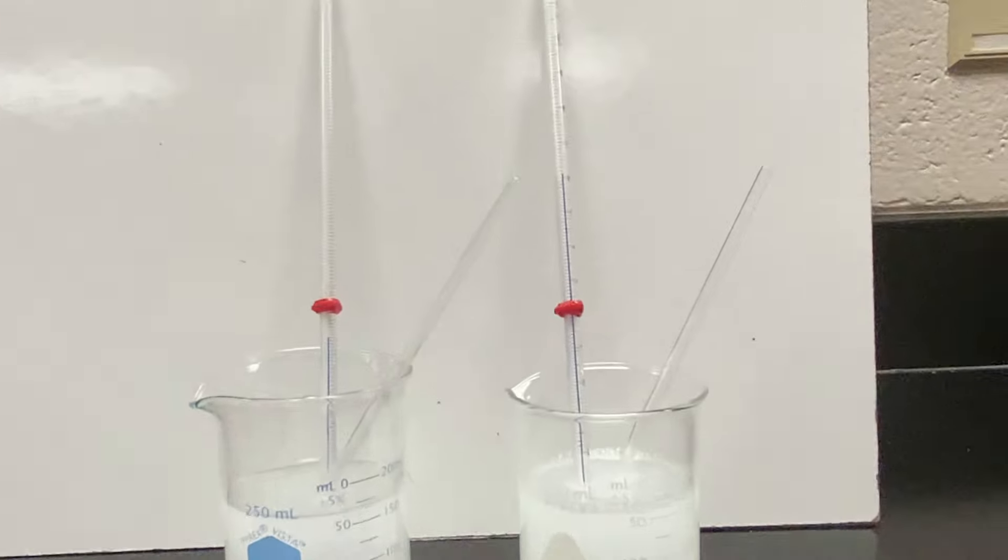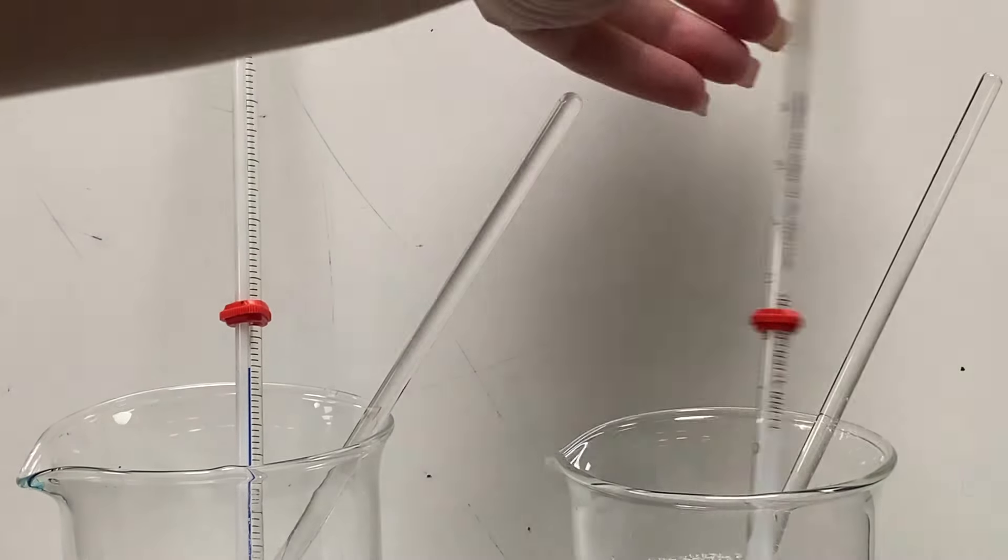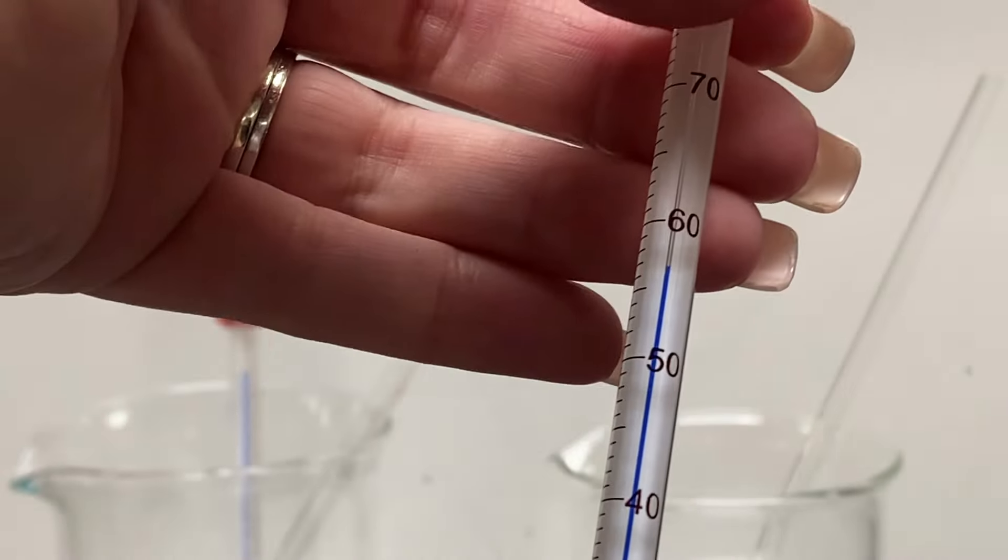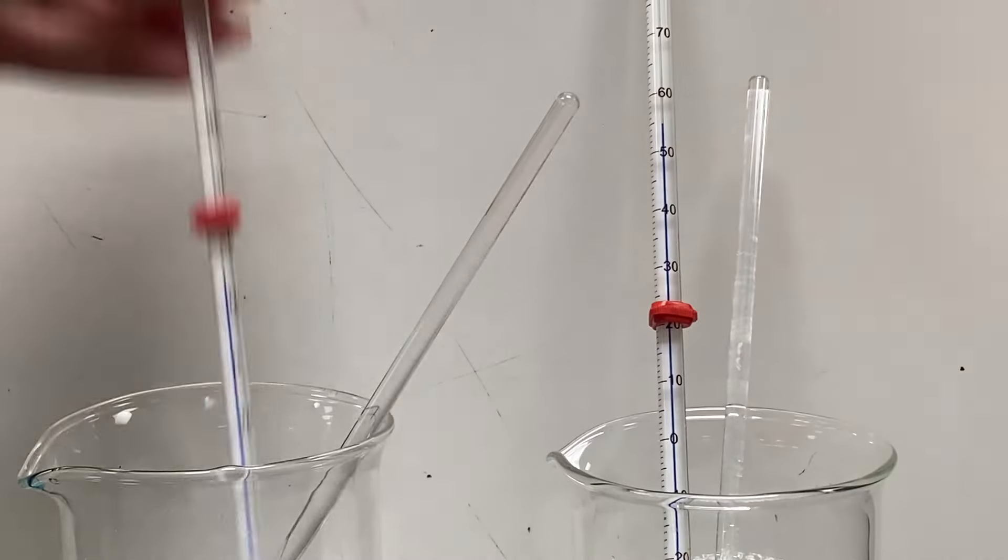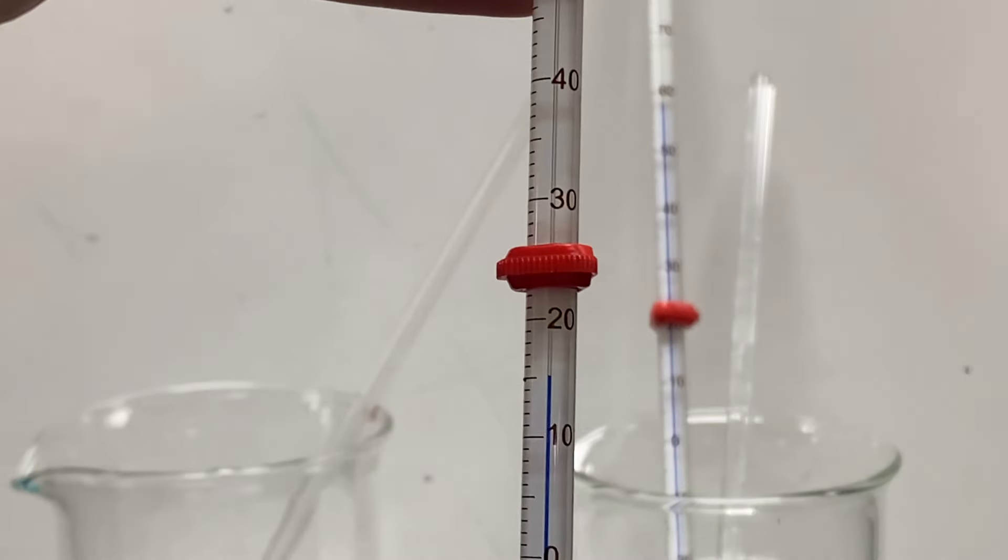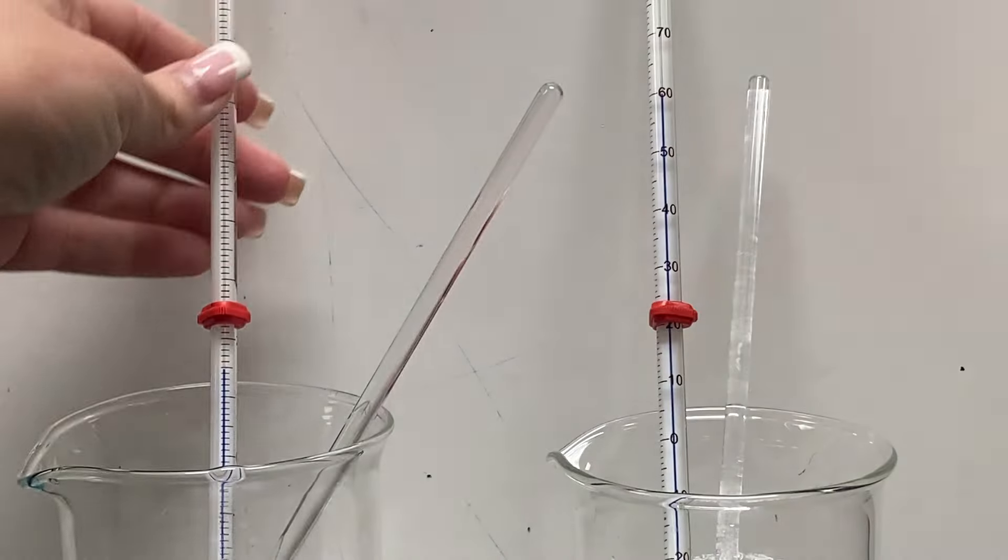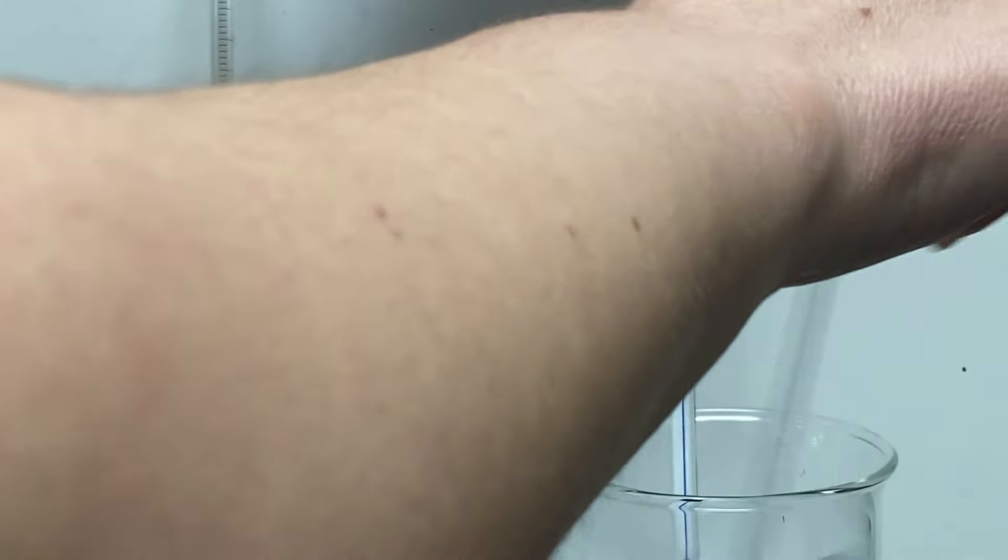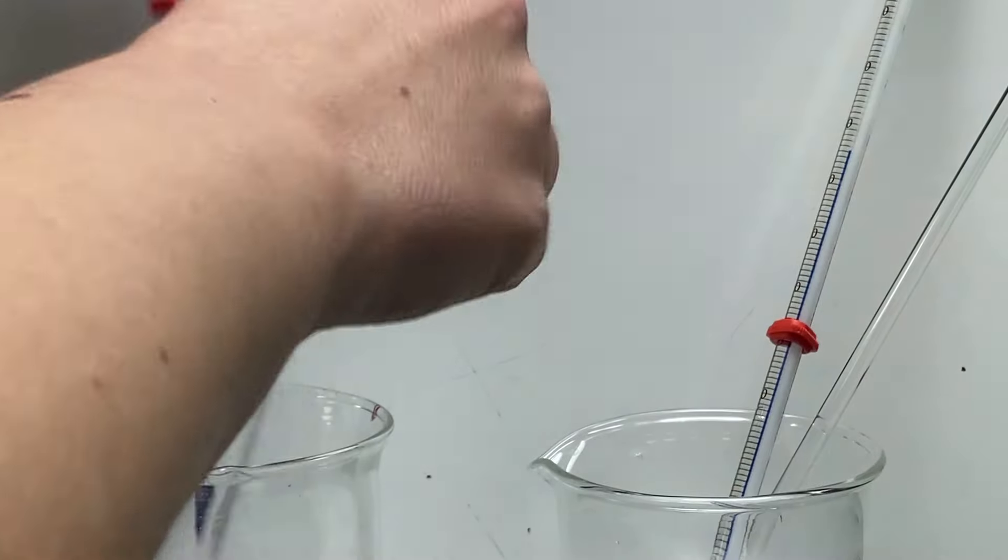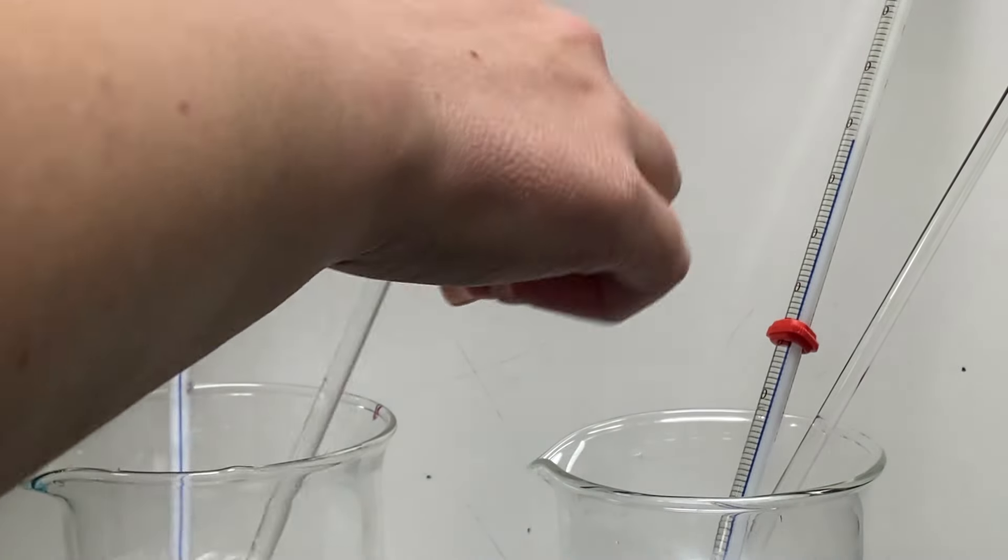This is a really awesome experiment to do in the classroom because you can easily put this in a Ziploc bag and just give it a good mix and pass it around to the class. And they can see that the calcium chloride is heating up and that the sodium thiosulfate is cooling down. It's just a really cool demo to do.